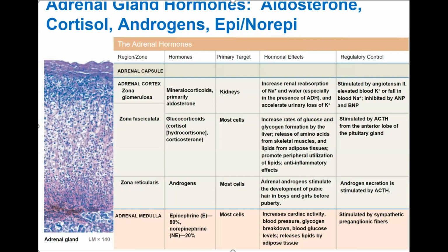The last thing you'll want to do as you finish your tour of the adrenal gland is review the functions of these hormones. Just be mindful that you may need to know more depth than what you're seeing here for a lecture course.